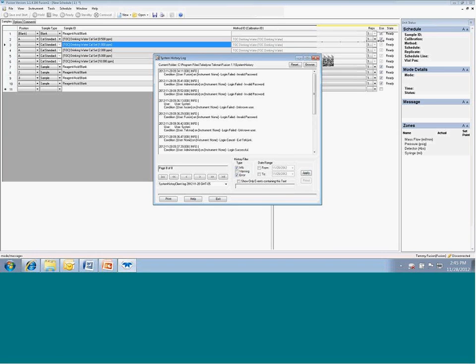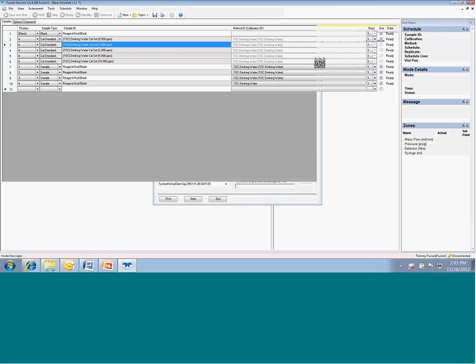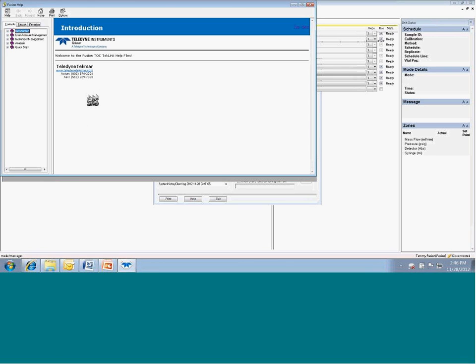Unfortunately, I'm not hooked to an instrument, so I won't really be able to show you anything. But you can go in and say, I want all the information, and I can separate it out by a date range. So if for some reason it's starting in the middle of the night, the first thing I would do is go to my history log and say, okay, what happened? It ran these samples, and then experienced something in between.